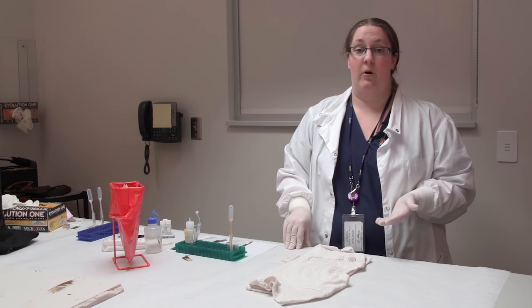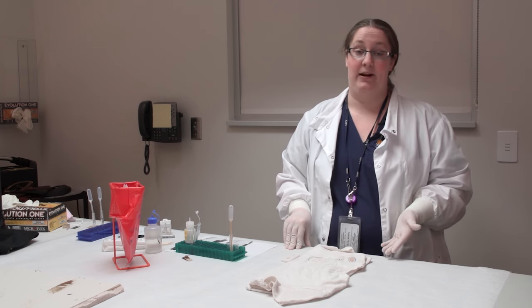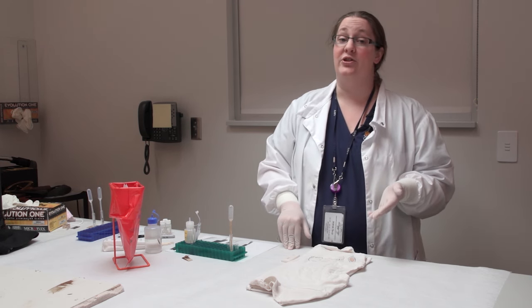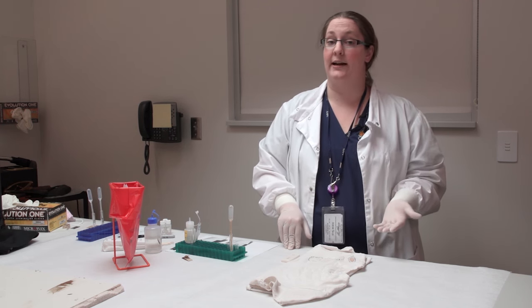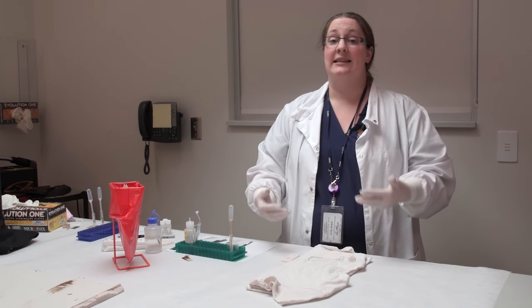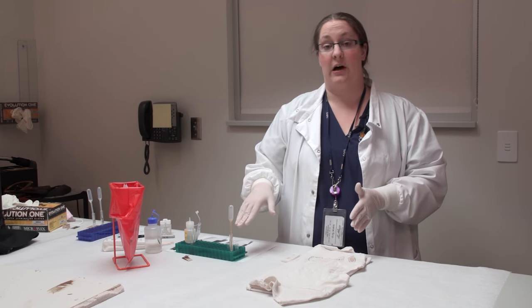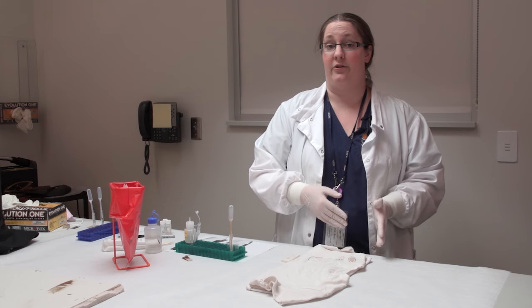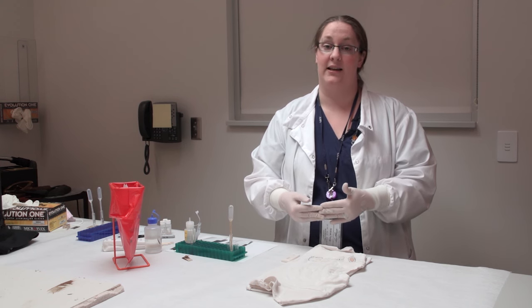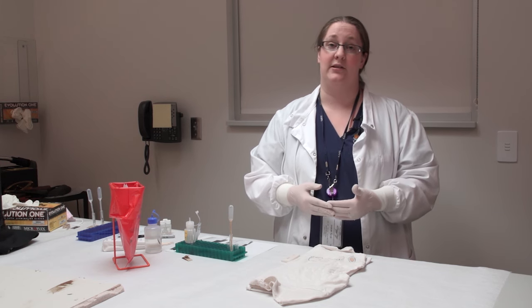The third and final test for semen is actually a microscopic sperm cell search. This is the only confirmatory test we have for semen - if you see a sperm cell, that is 100% positive for semen being present on that item. However, we do deal with cases where males have gone through a vasectomy and do not have any sperm cells left. Using the two other presumptive tests together gives us an indication that semen is present without seeing sperm cells, because the body fluids that react with the acid phosphatase test that are not semen are not the same body fluids that react with the P30 test. So if we get a positive result on both presumptive tests, that's a good indication we're dealing with semen.